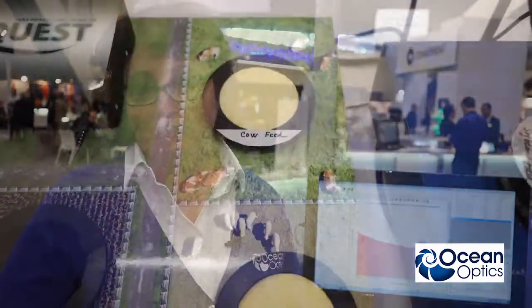And the demonstration that we're showing is using the same components that we developed more than 20 years ago to make measurements in the ocean to help farmers with their agriculture applications. Now, these types of measurements are very important so that farmers can make sure that they're not using too much fertilizer, that they've got the right levels of moisture and organic material. And using the Ocean Optics components, they're able to make these measurements in the field. So we're now taking our measurement to the sample as opposed to having to take the samples to the measurement.